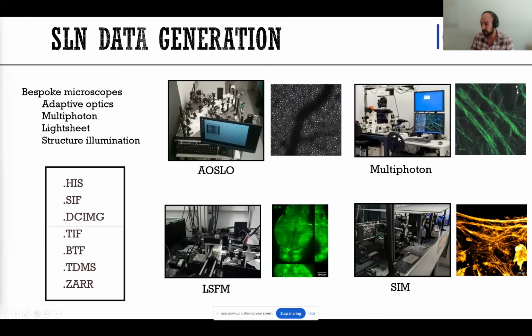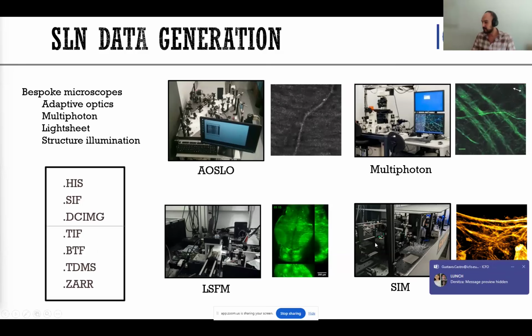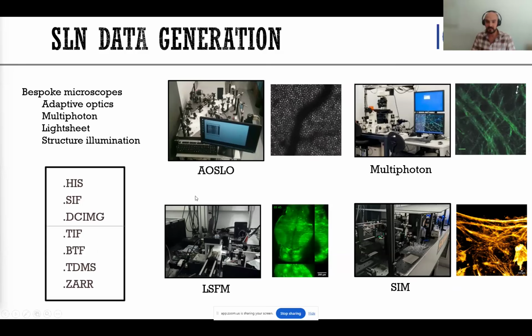As we are developing our own solutions, we depend on the cameras and the different detectors. Each camera, each brand, has its own file format to store the data, and there are also many standards that depend on the community that establishes which is the standard. So in most cases, this was managed across multiple dimensions while trying to manage this large volume of data.